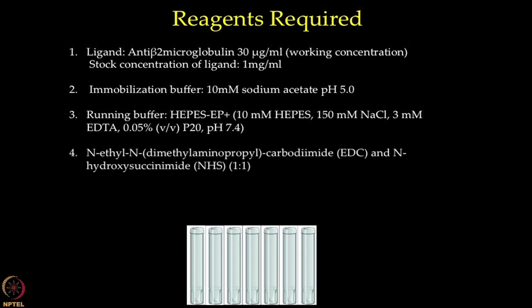EDC and NHS in the amine coupling kit are used in 1:1 ratio for surface activation. Lastly, we also require 1 molar ethanolamine HCl pH 8.5 for blocking the free ester groups on the surface. We shall now proceed to use the above mentioned reagents for our immobilization experiment.